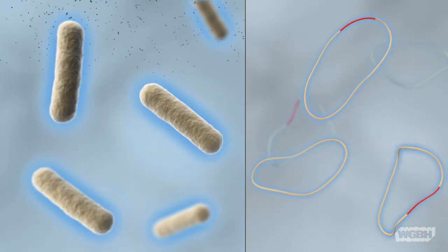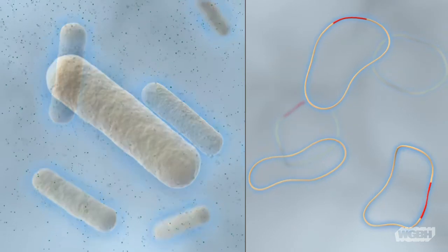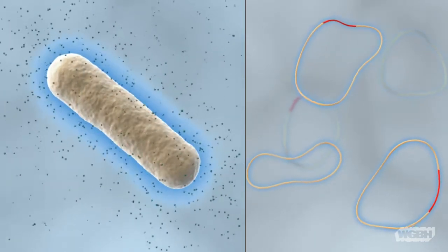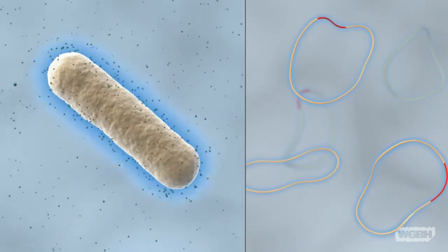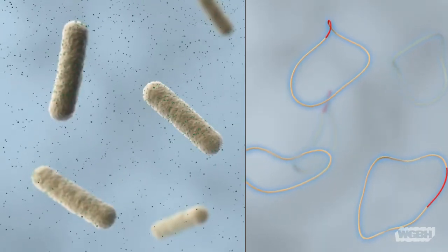Since they are both negatively charged, they tend to repel one another. To facilitate this interaction, calcium chloride is mixed in with the bacterial cells. Once in solution, the positively charged calcium ions bind to the negatively charged phosphate groups on the cell surface and neutralize their charge.